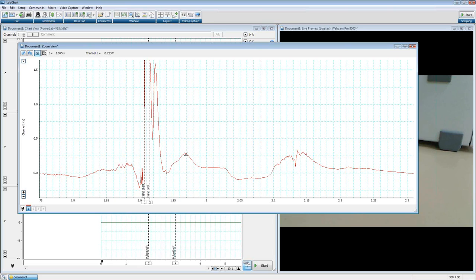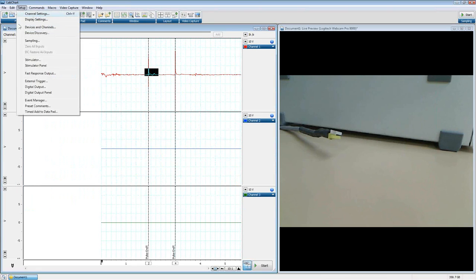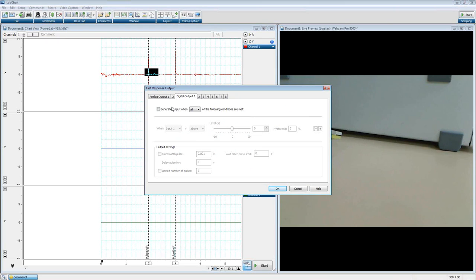If you have questions about that, definitely put them into the questions box in the GoToMeeting control panel, or you can email me if you have more questions. I can show you a little bit better what exactly it means. But it's a percentage of total range. That's a big thing to remember as well. So if you're recording at a range you probably shouldn't be, you'll see really strange small hysteresis values, and you wonder why, and that's why, because it's a percentage of total range.